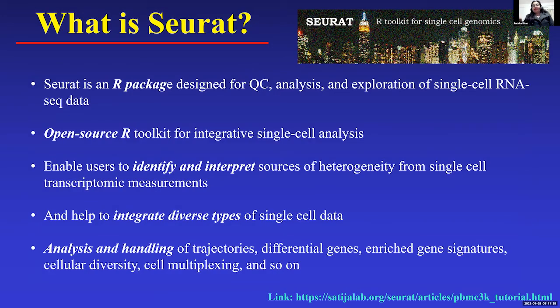So what is Seurat? Since we have all this data with us and we want to see the data so that we can interpret it easily, Seurat is an open source toolkit which will help us in doing all the steps necessary to interpret the data, from a matrix form to something which is more easily understandable.